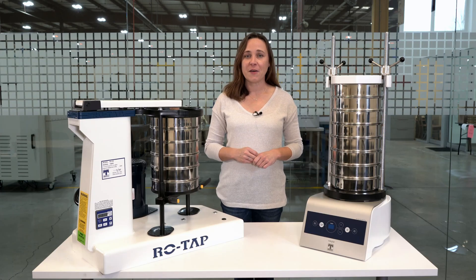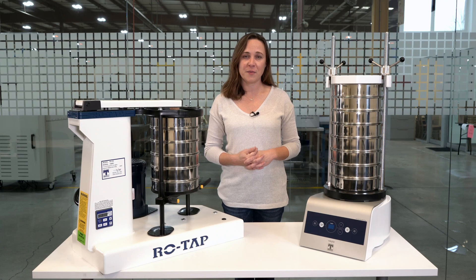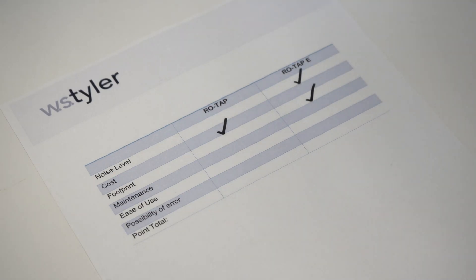The ROTAP-E is about half the weight of the mechanical sieve shaker and takes up much less space on a laboratory tabletop. So in this category, we'll give the check mark to the ROTAP-E.